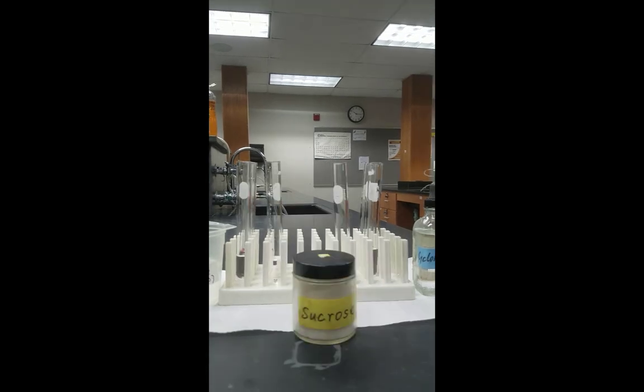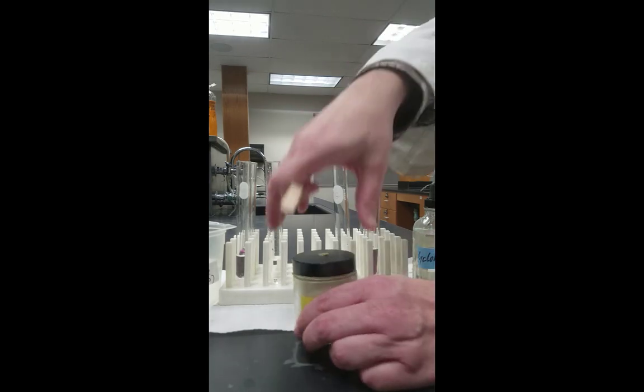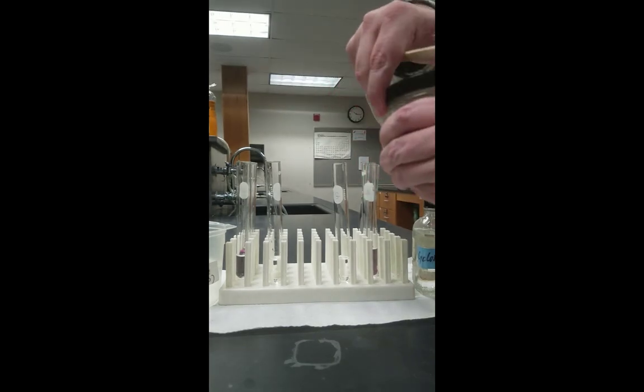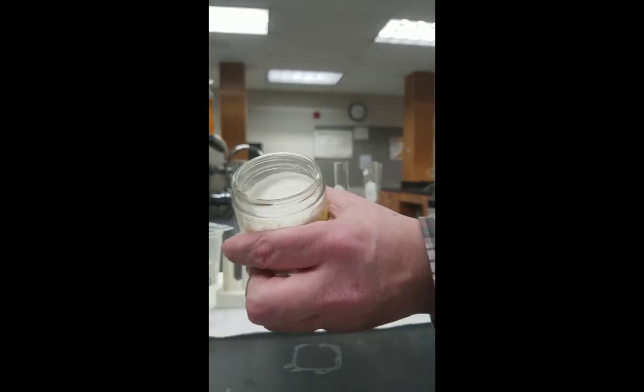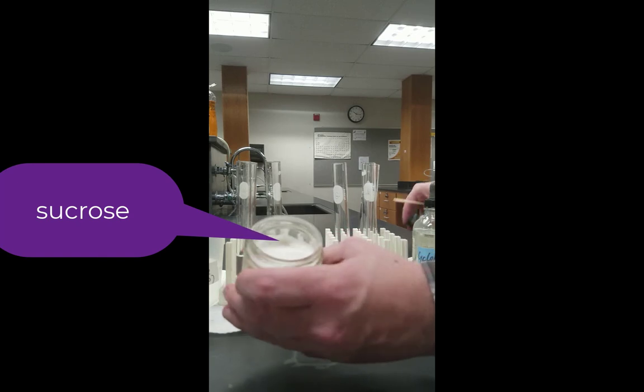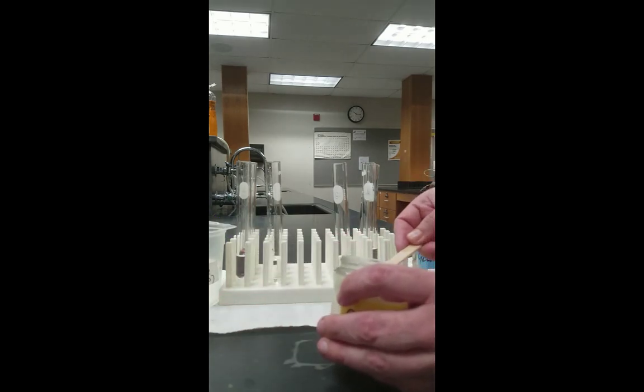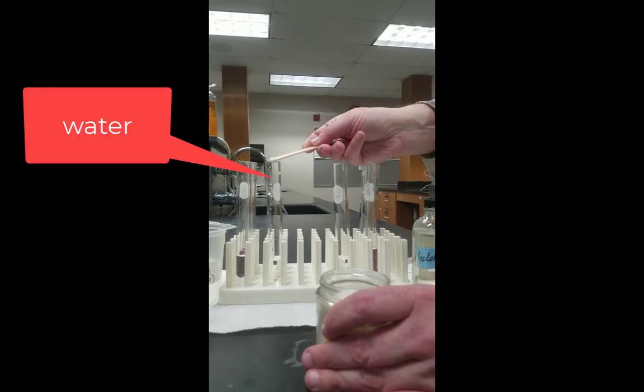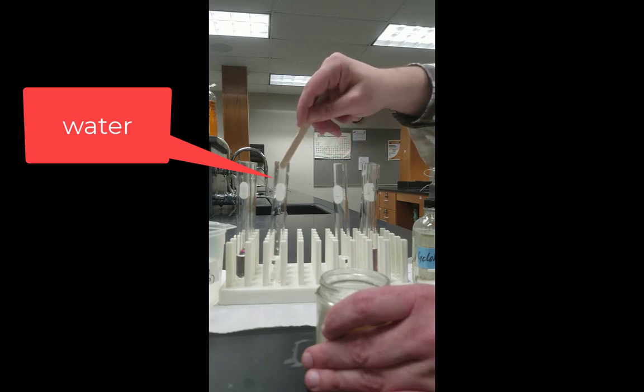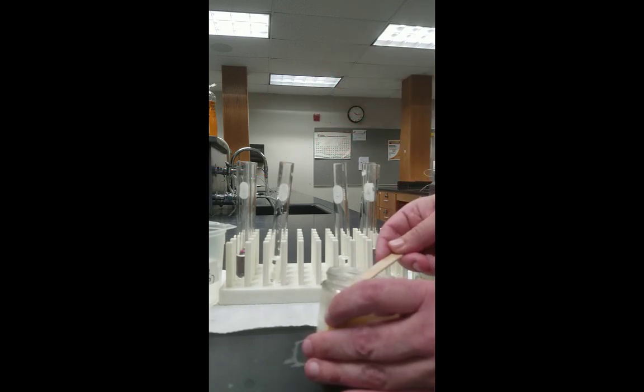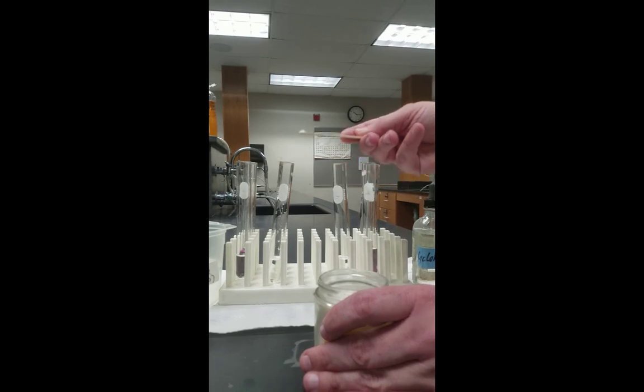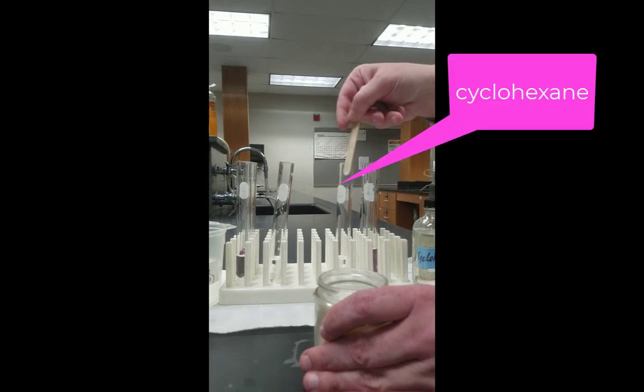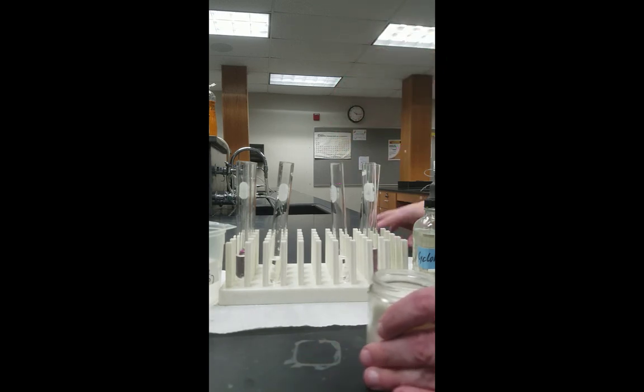Now we move to sucrose. Again, that's table sugar. I'm assuming you have all seen table sugar, so it shouldn't be too much of a surprise to you to see that it is a white solid. Now this one will be just a little bit more difficult to visualize because white solids tend to give colorless solutions. So what we're going to have to look for here is whether or not the solid remains dissolved or if it just goes to the bottom of the test tube in the salt.